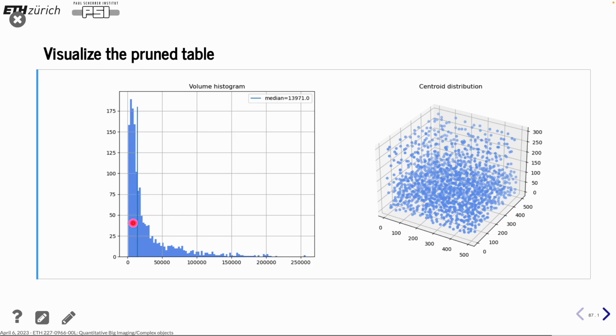But most are down here, around 5 to 30,000, and then we have some larger items. And if you squint your eyes, you are able to see that we have 2 distributions here. One distribution with very small items, and one distribution which is wider with larger items.